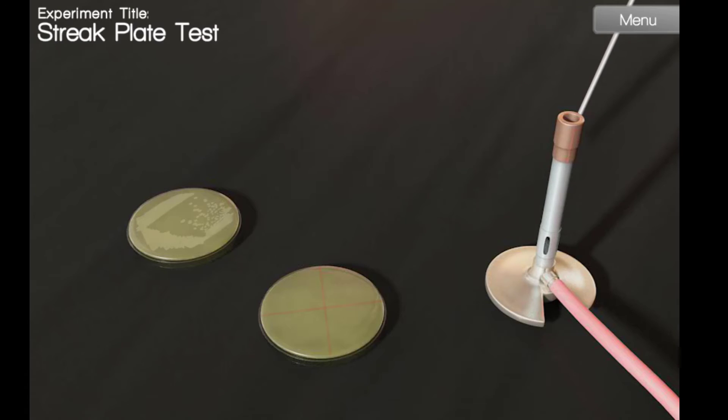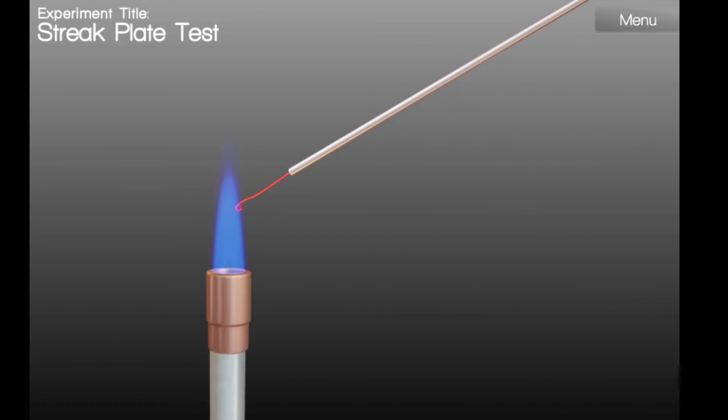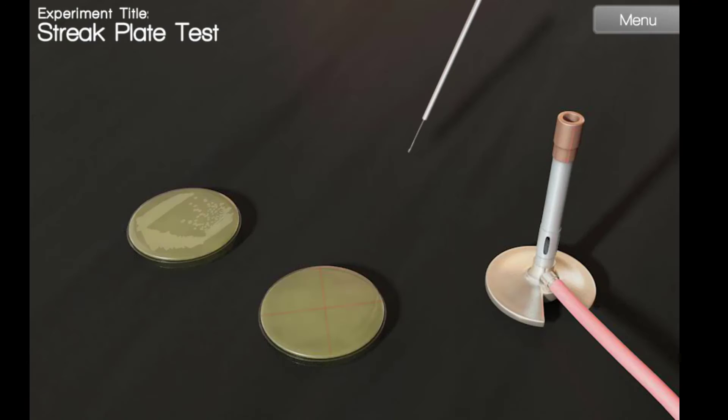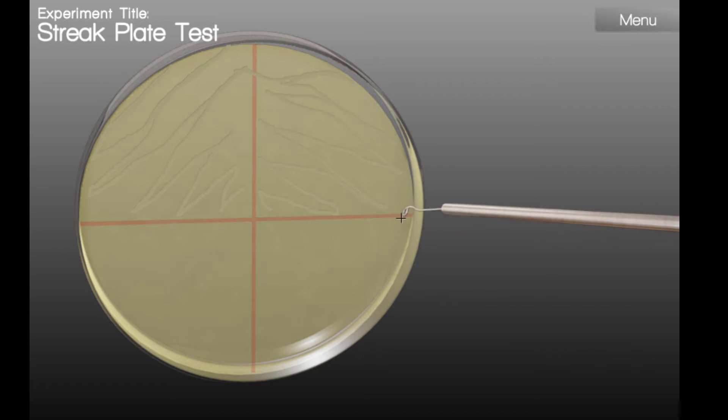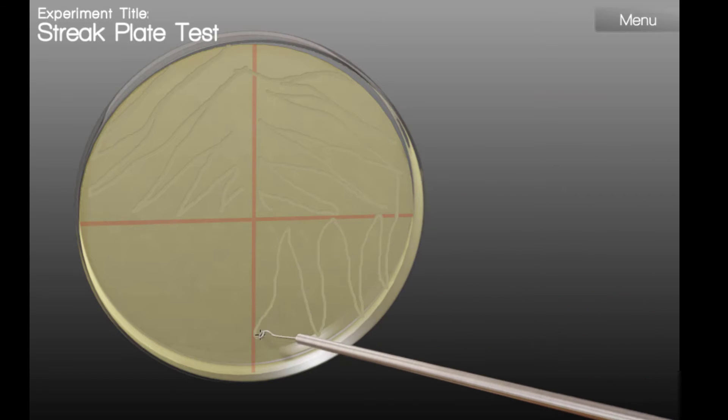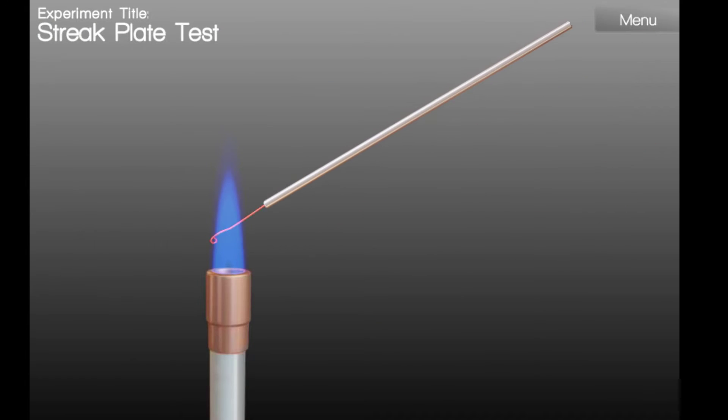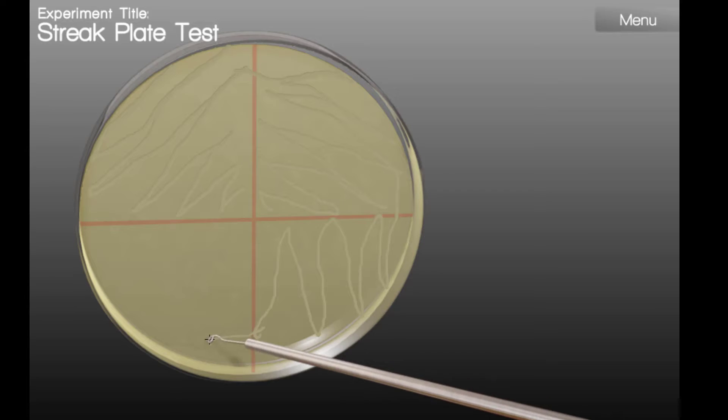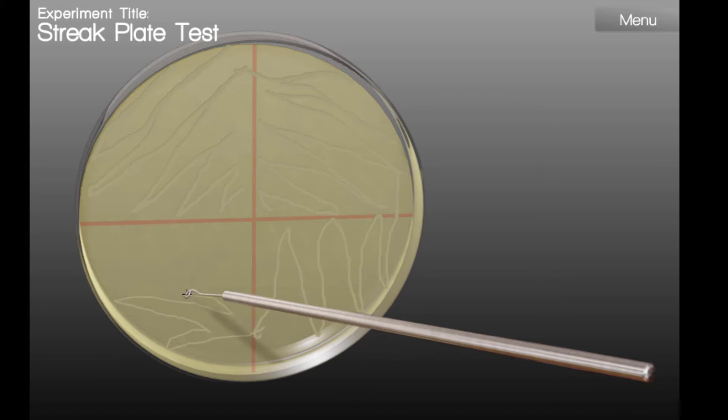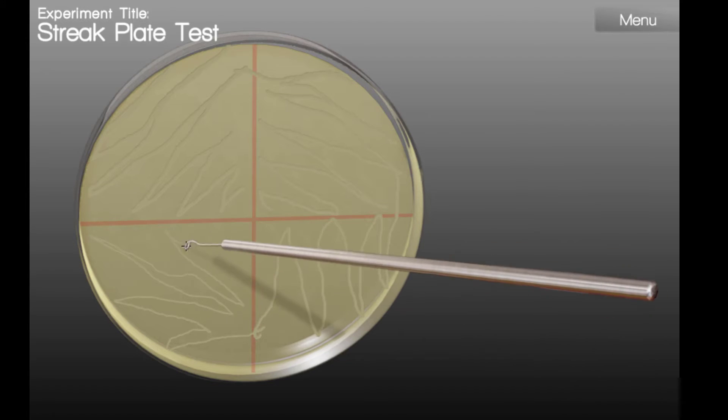I'm going to flame the loop once again, and repeat the procedure by dragging just a small amount of the inoculum into the third quadrant. I'm going to flame the loop once again, and streak our last quadrant, remembering to drag some of the previous quadrant into the new quadrant.